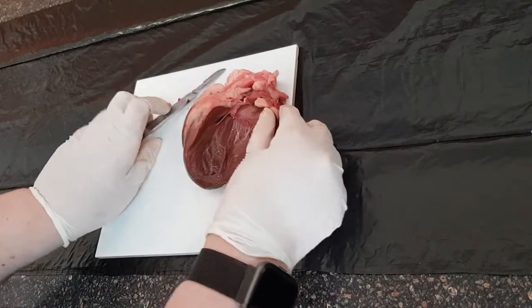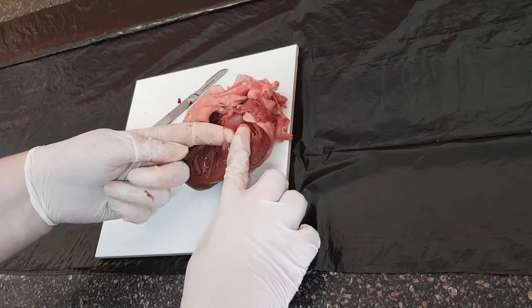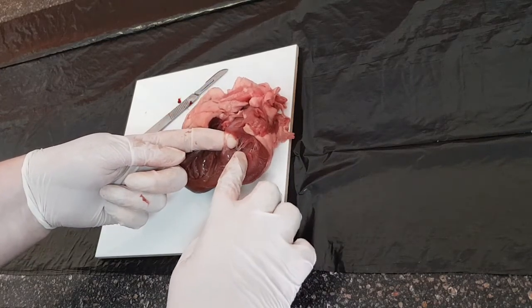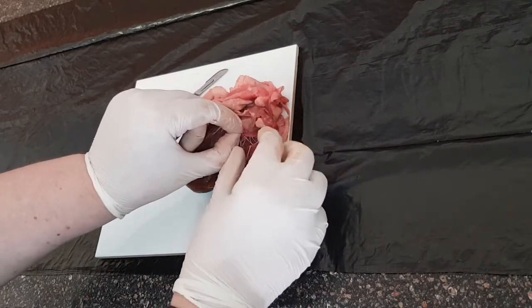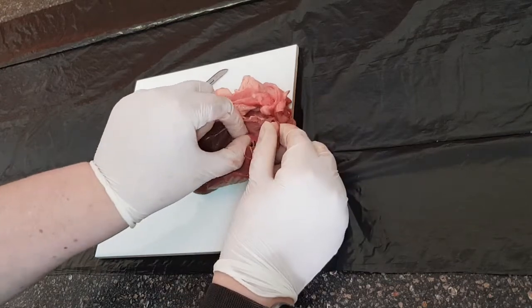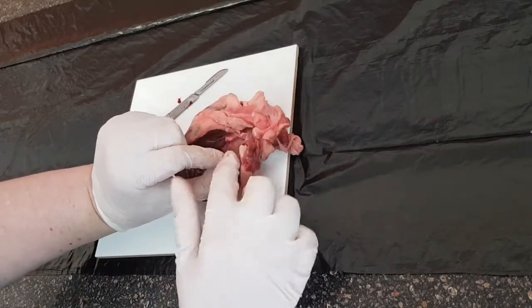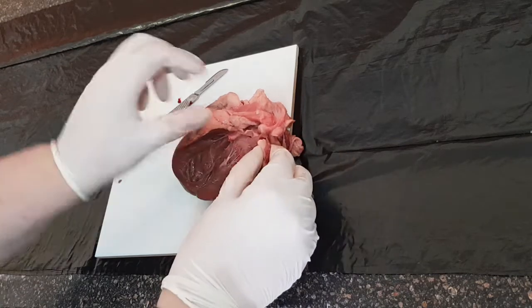your ventricles. And then all of these things here are your valves. Valves are connected via tendons, and you would have valves closing from one side and the other side meeting in the middle. Can you see that? There's your valves there, separating your chambers in there.